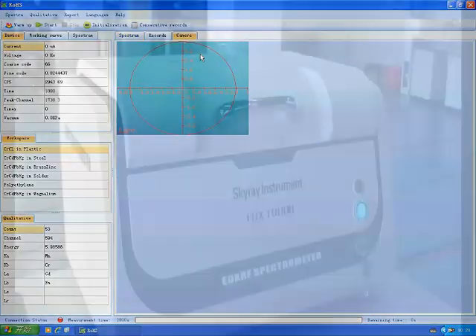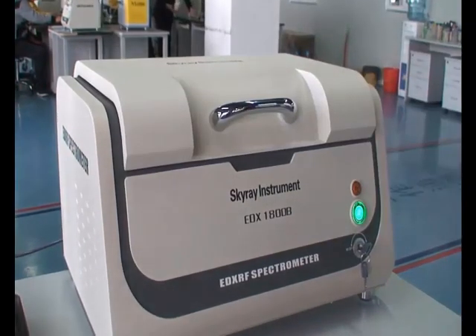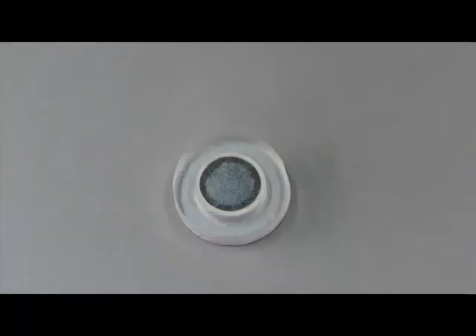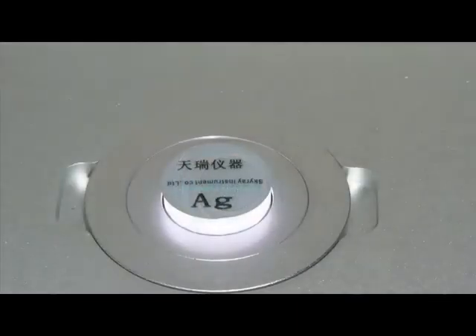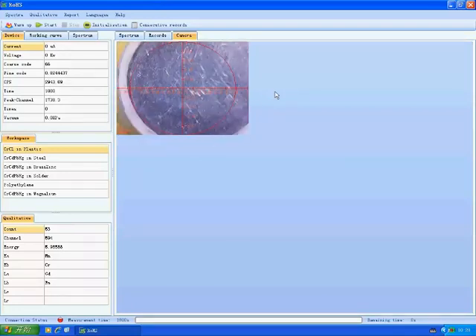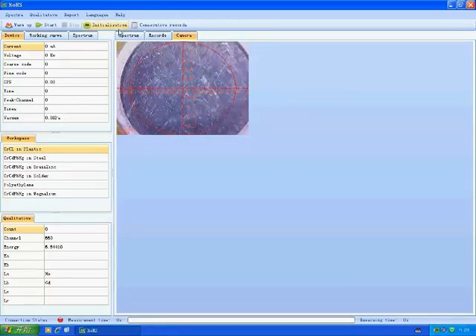After warming up, we replace the waste sample with a pure silver sample. Click Initialization. It reminds us to place a silver sample. After properly placing the silver sample, click Confirm in the interface. After the filter and collimators are in the right place, it will start initialization. Now we can see that initialization is completed.